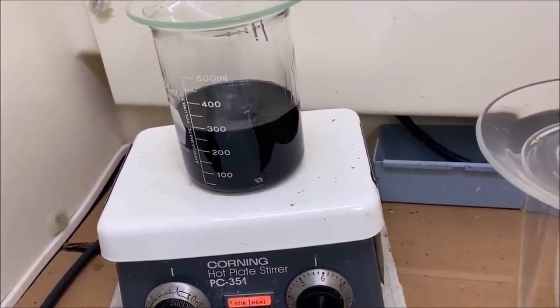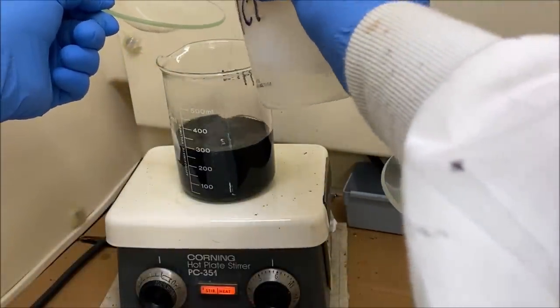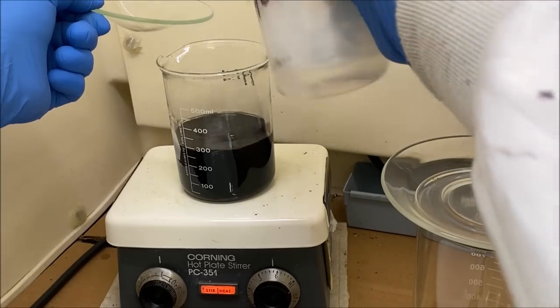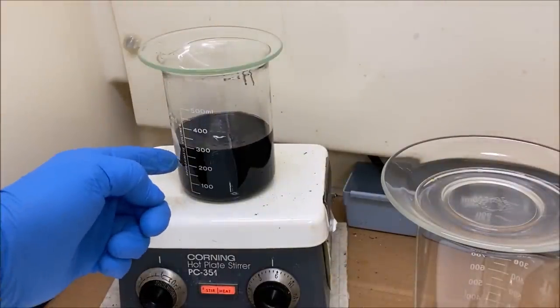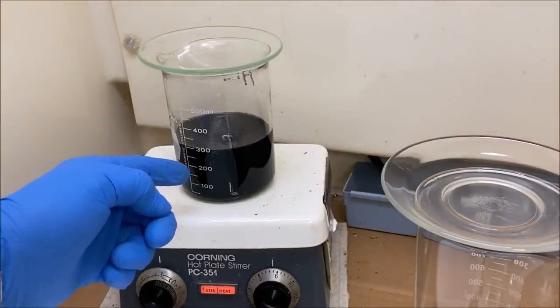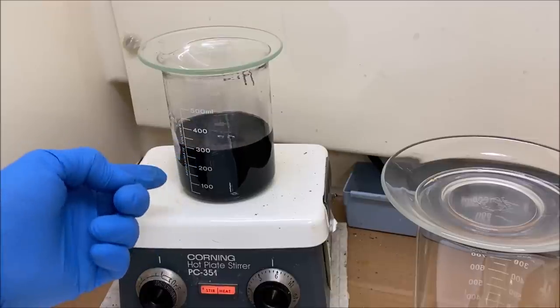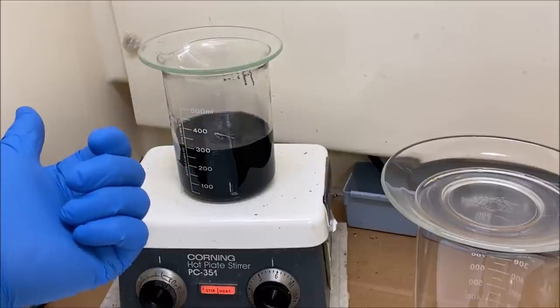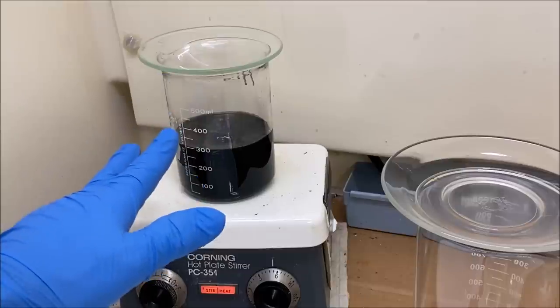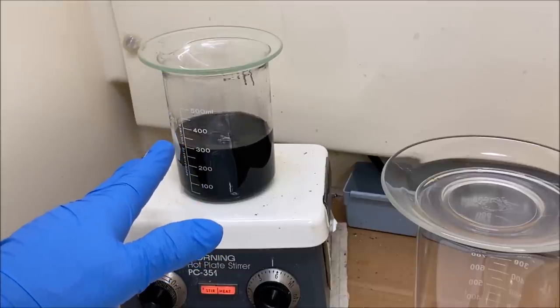Let this continue to cook and dissolve and see how much more of the solids we can put in solution. I've noticed in the comment section, there's folks making comments about the iridium. If there is iridium in here, that it won't go in solution. And it won't. Aqua regia doesn't dissolve iridium very well. So the logical assumption would be that the aqua regia is going to put all the platinum in solution and leave the iridium behind. And that's just not the way this works with these platinum group metals.